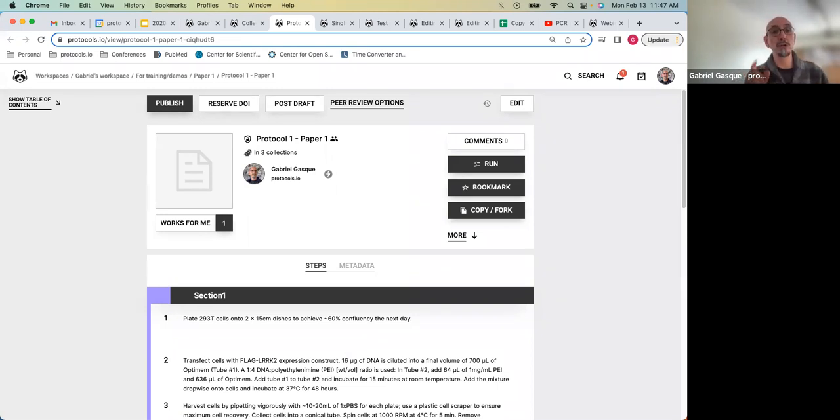But if you only want to share one specific protocol with one specific person, I recommend sharing it directly by using the share button. Brigitte, let me know if I didn't answer your question.